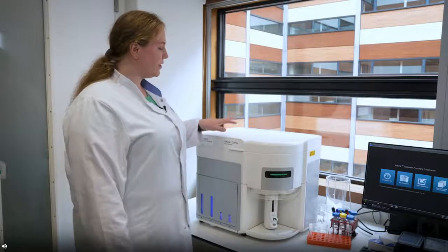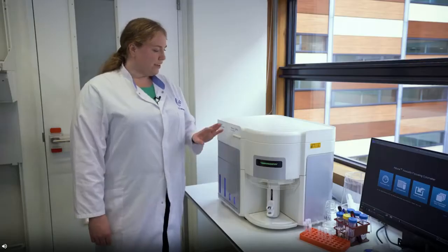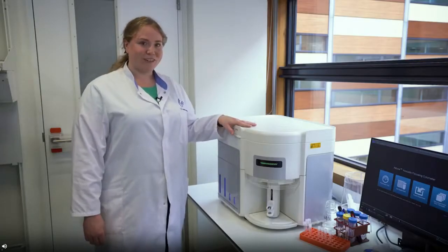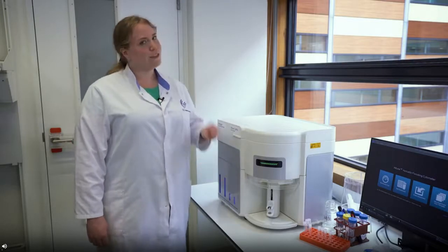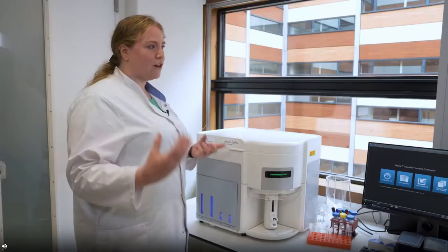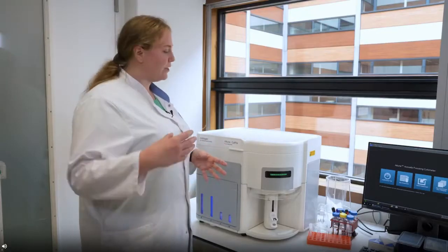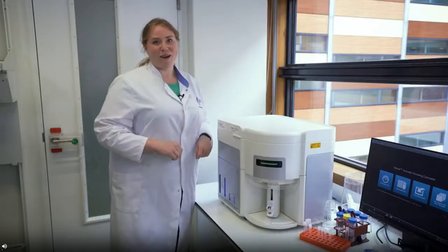So this is built on top of the Attune NXT acoustic flow cytometer. And I was really excited to be able to add this imaging function to an Attune because our Attune is one of the workhorses in the lab. The fluidics are very, very stable. It just keeps running. It's able to run really large volumes. So the sample line is really easy to clean to reduce sample carryover. I just love this instrument. We have a skin lab here that runs all of these very large cells that are adherent cell lines, and we can just clean out the system really nicely. So now I'm going to take you over to the software and show you the real power behind the system.